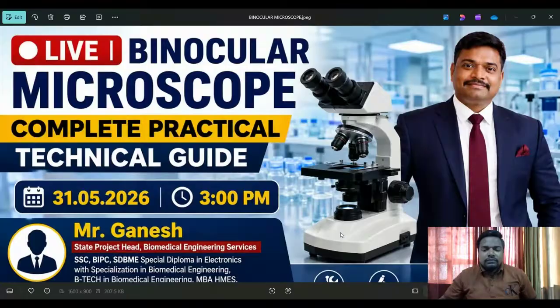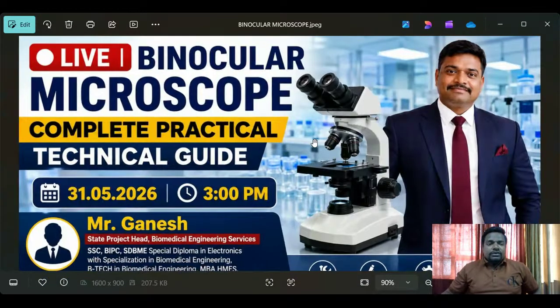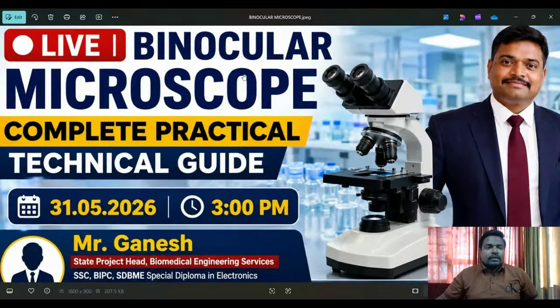Let me show you today my microscope. Today I'm going to give you microscope information. See here: live binocular microscope, complete practical and technical guide. Today, 31/5/2026, 3 p.m. live session.